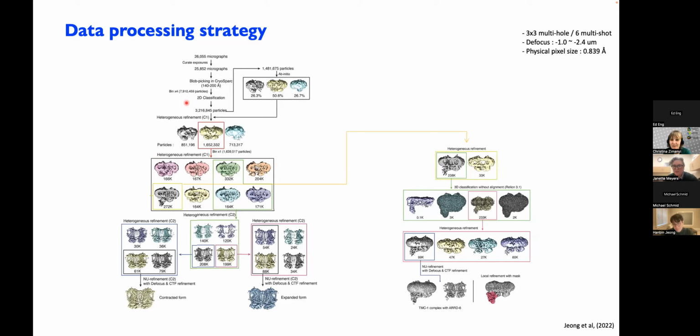Okay, next one. Nice talk. I might have missed this. How did you decide which proteins you think are the subunits of your complex according to your mass spec result? Like how you chose the first 3 proteins. Why didn't you choose the 4th one on your list? How do you set up the threshold? Oh, actually, yeah.